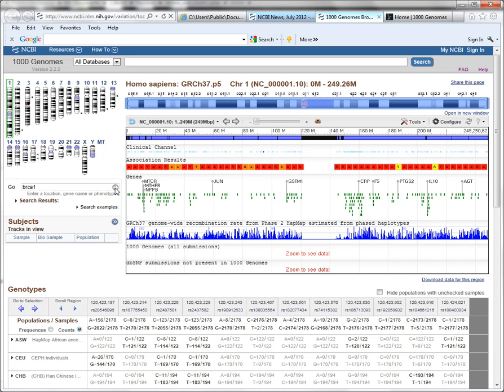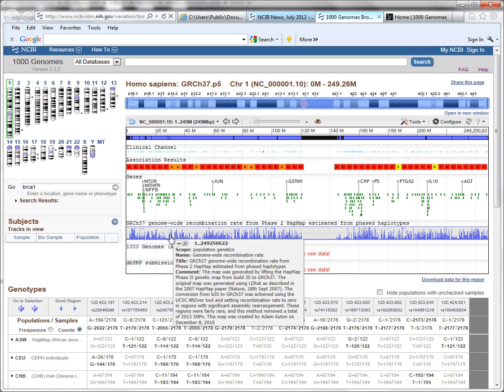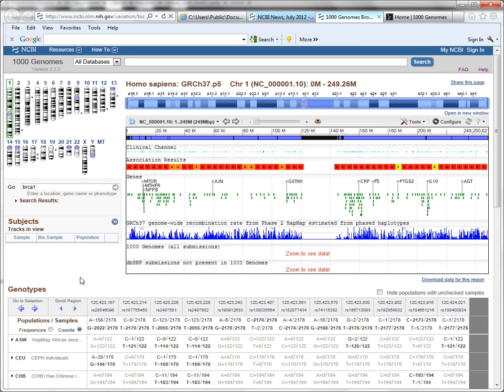Click go, and then the entire browser page will reload to that location. This is a widget that allows you to select the subjects that you want to view in your tracks, both in the genotypes and the sequence viewer.